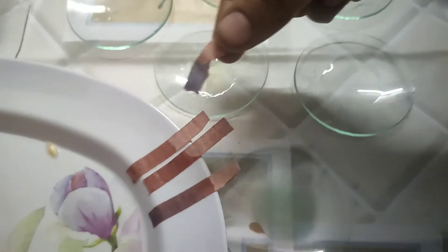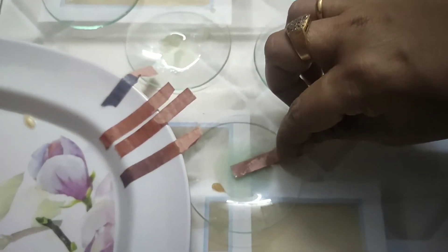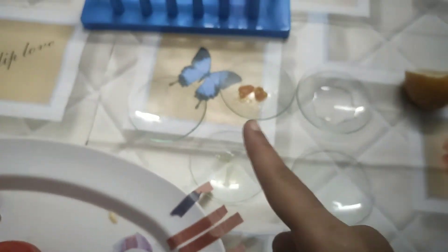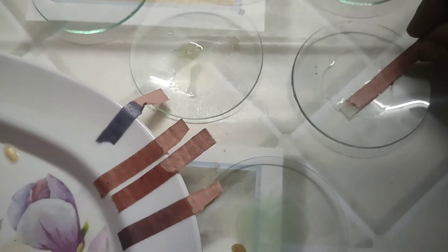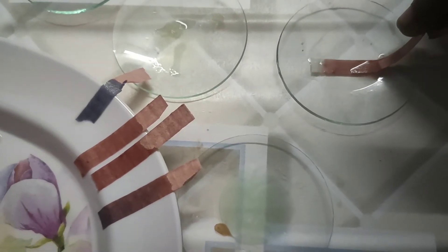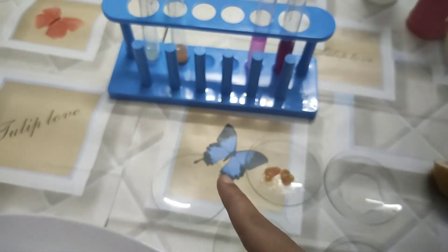Now taking one more substance — it changed to blue color! That means that substance is a basic substance. Red litmus paper changes to blue only in basic substances. Testing one more substance — it also slightly changed to blue, indicating it is basic.